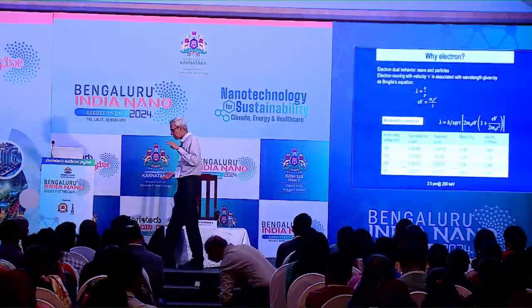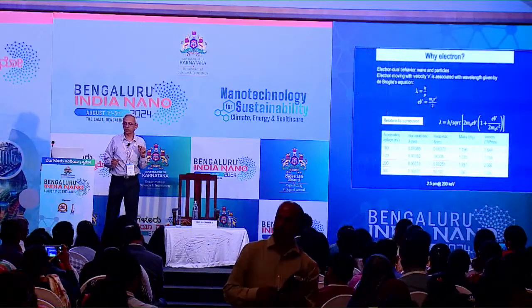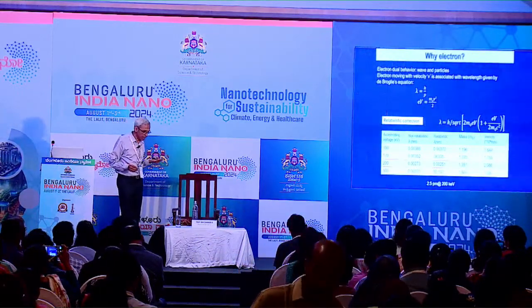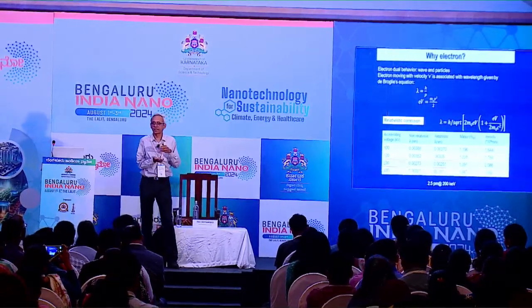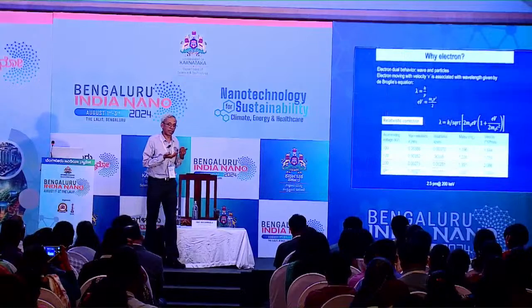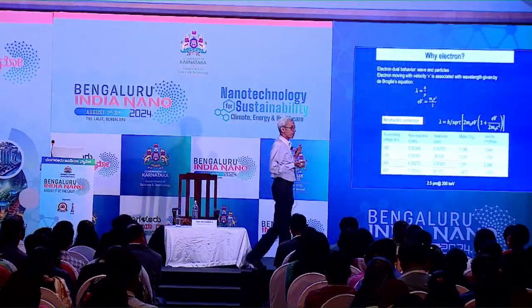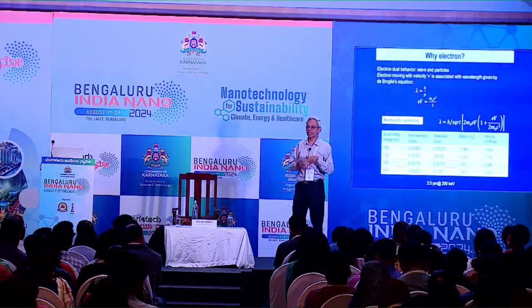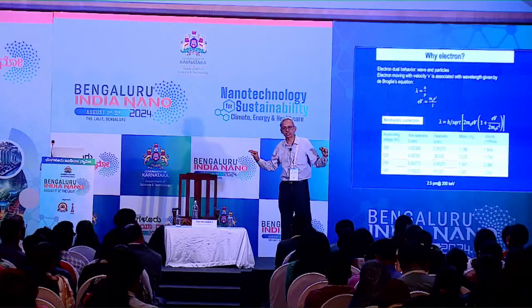By using a much smaller lambda, hopefully we can get a much higher resolution. But that's only one part of the story. It turns out that the lenses we use in the electron microscope, obviously, are not glass lenses. They're basically electromagnetic lenses. Unfortunately, the quality of these electromagnetic lenses is much, much poorer than glass lenses in terms of spherical aberration. They're extremely poor lenses.